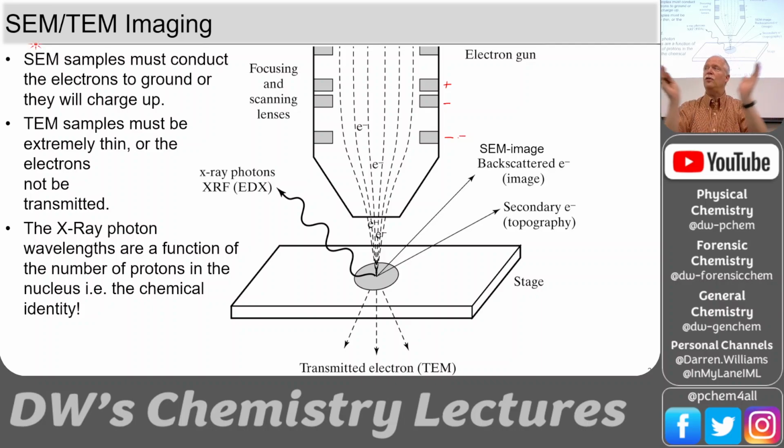So we can control the beam of electrons just like lenses control the beam of light. These are called electronic lenses, in quotes. We charge those rings up at different voltages, and we can tighten or expand the electron beam. We can also steer it left and right.